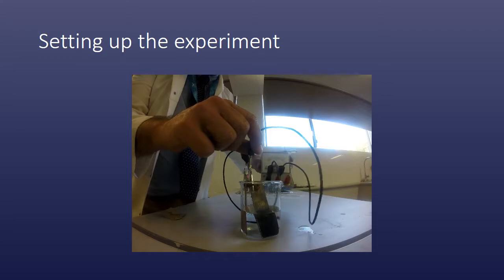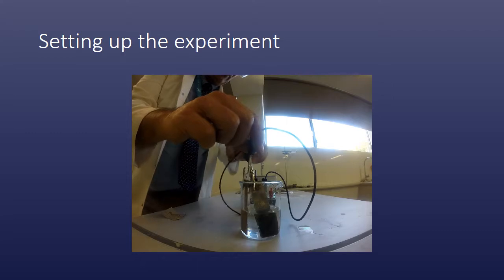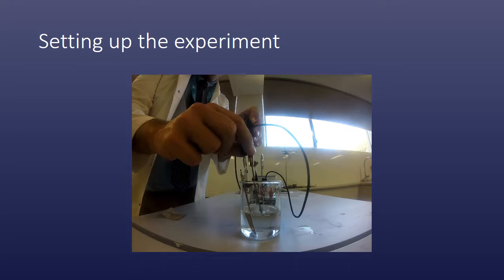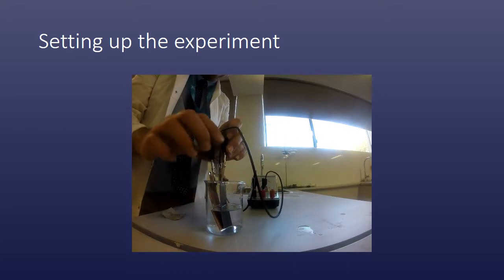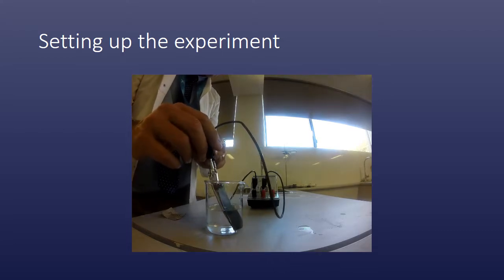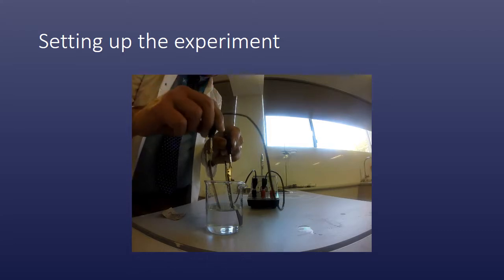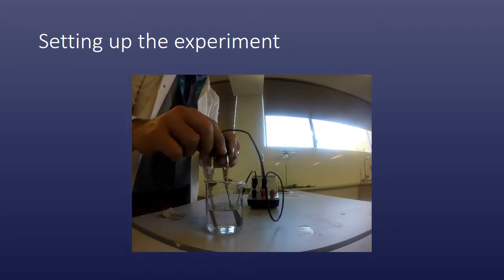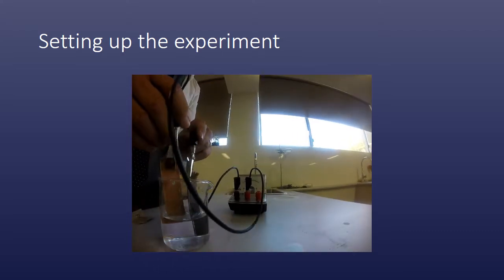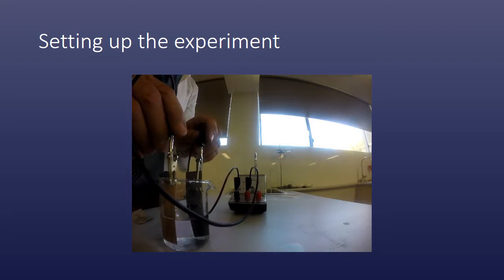on my voltmeter that is somewhere in the vicinity of about 0.2 of a volt. So not very much voltage there, but you can see that I should move that aside a little so that you can see a little better what's happening with the voltmeter. The reading is occurring when the two electrodes are both placed in the solution. Now, as far as our electrochemical cell goes, 0.2 volts is not very much of a reading.